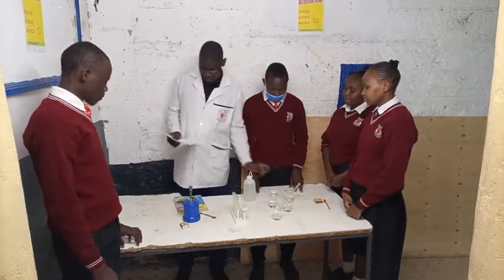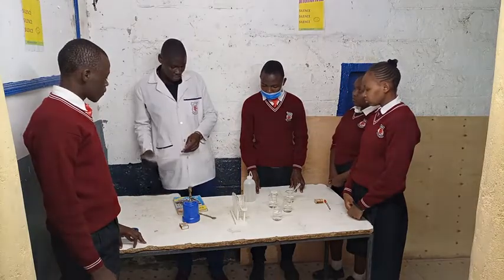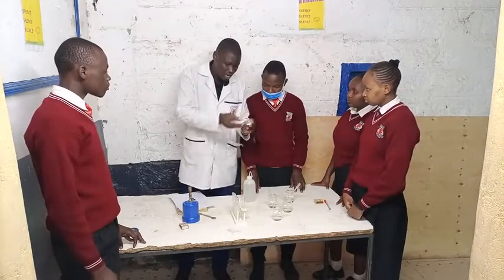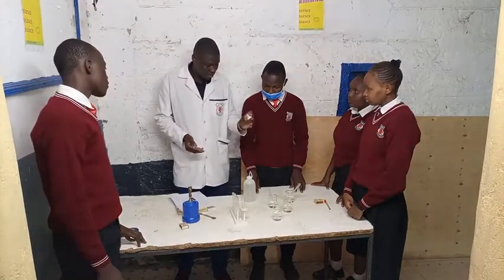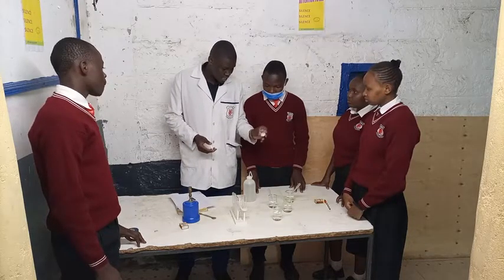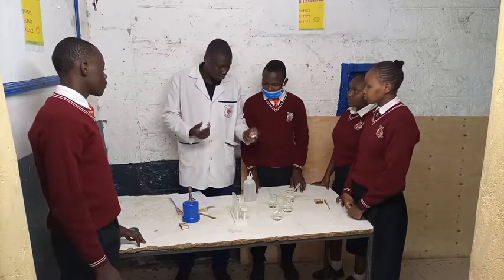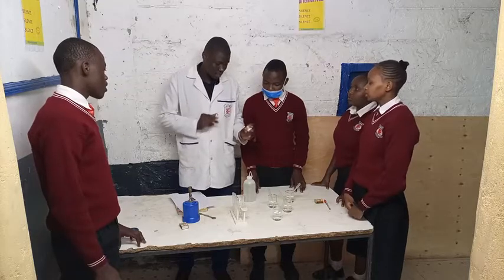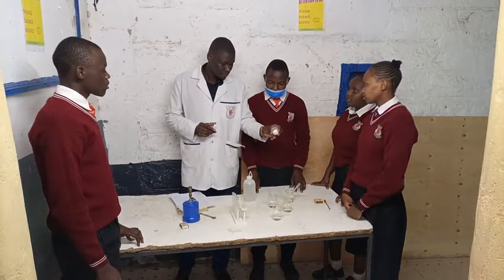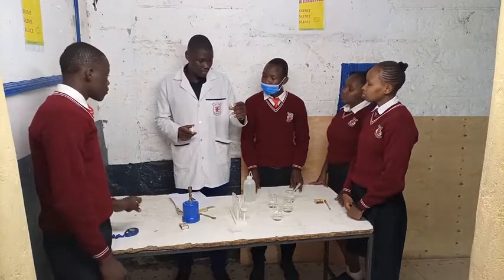So the question goes like, now describe the appearance of the solid. Through that, we need to open this particular solid and see. In describing the solid, we are supposed to look at the color and, if possible, the texture. When I'm talking about texture, I mean the roughness or smoothness of that particular solid. Now, what's the color of this solid? White.